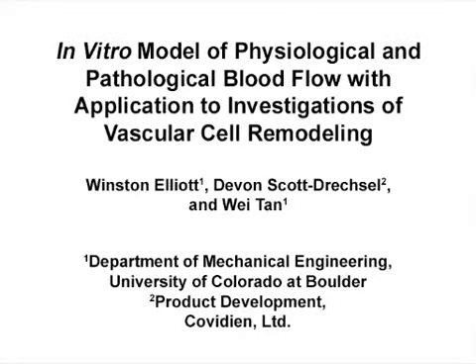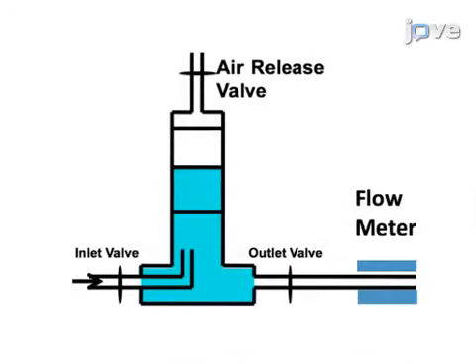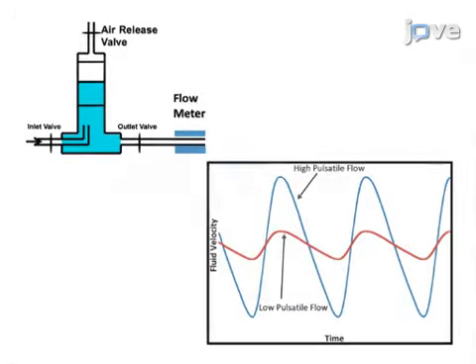The overall goal of the following experiment is to observe the effects of different pulsatile flow pathologies on endothelial cells in vitro. This is achieved by first chemically treating glass slides and coating them with protein to ensure cell attachment during exposure to flow. As a second step, the pulsatility index of the flow is determined, which allows for comparison of in vitro flow to values described in the literature.